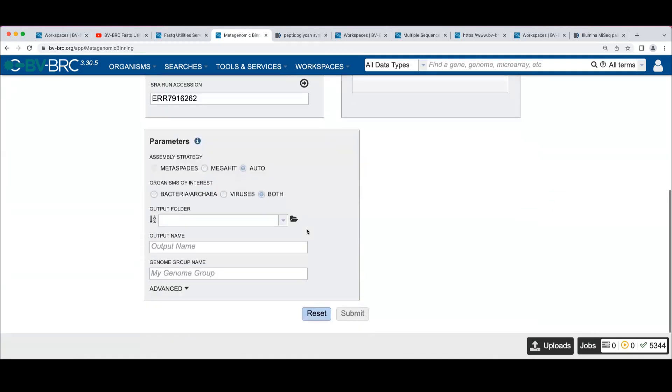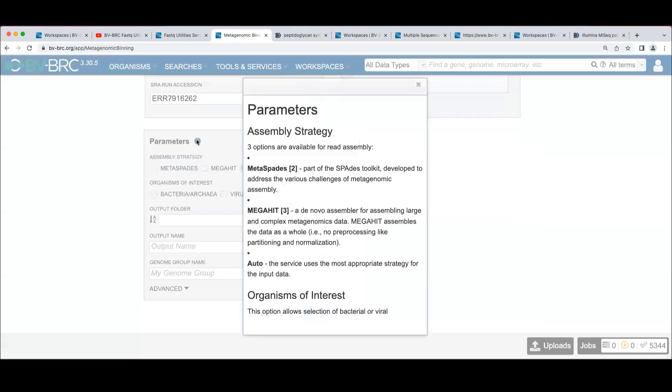So we can choose the parameters. Also, another thing is that whenever you see one of these little eyes, you get some more information. So we can see that our three options here are Metaspades, MegaHit, and Auto.